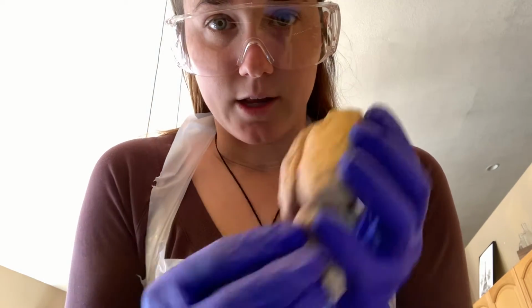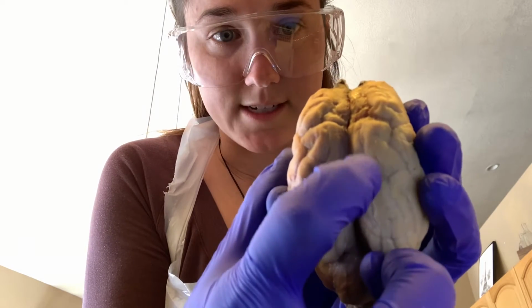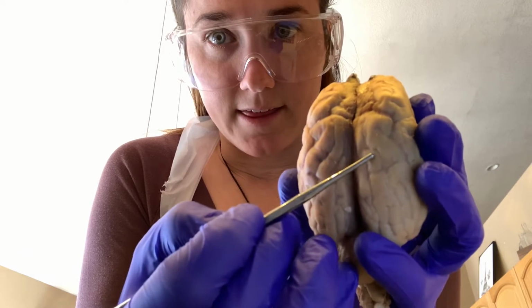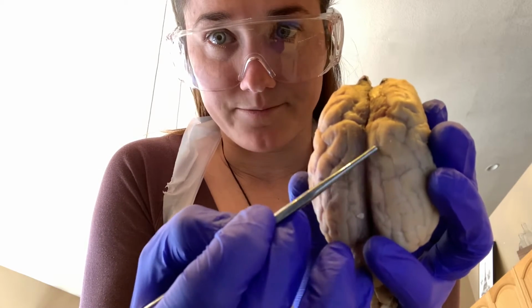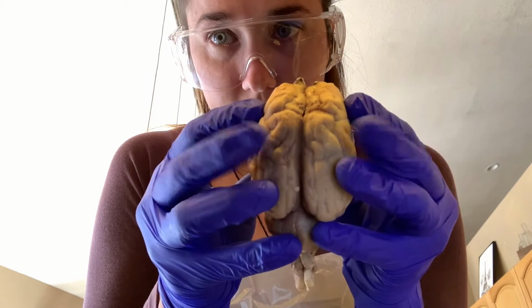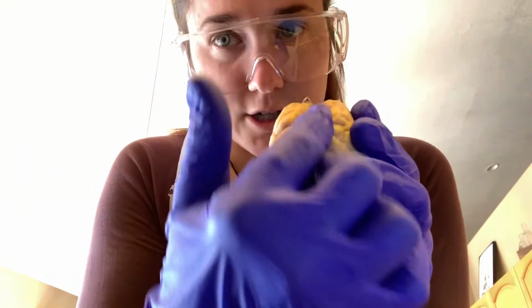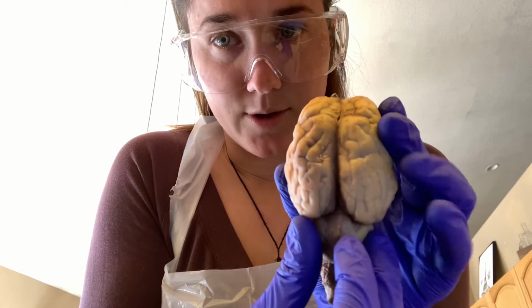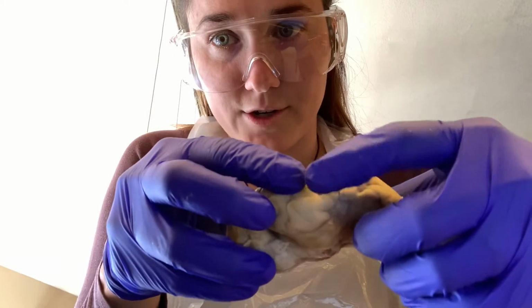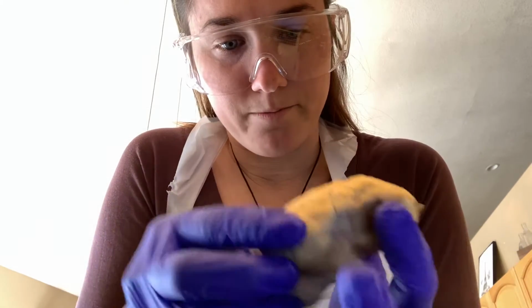Now, if we want to take a closer look at the brain, we can see that there are these ridges and depressions, and the ridges are called gyri, and the depressions are called sulci. From this position, you can also see that the brain is separated into two hemispheres, and this line here is called the longitudinal fissure that separates these two hemispheres. Another important fissure would be this lateral fissure here, and this separates the frontal lobe from the temporal lobe.